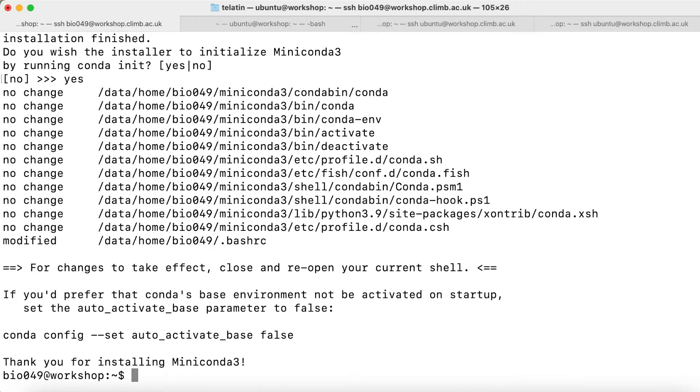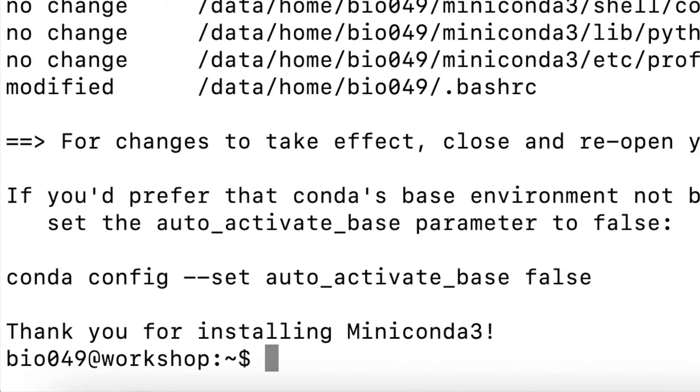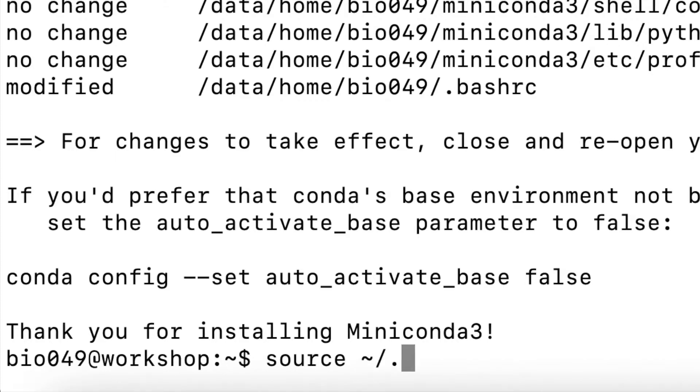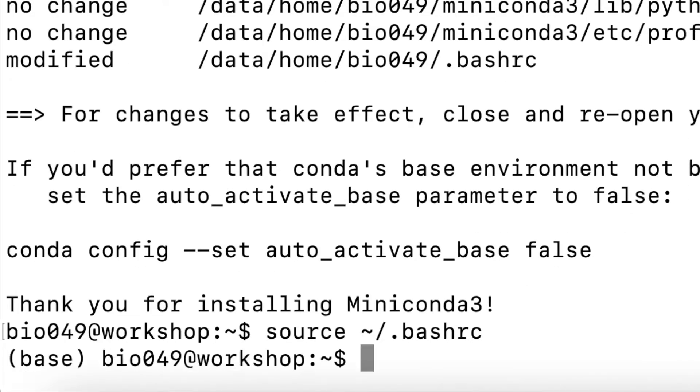Now Conda is installed but not yet active. In order for the change to take effect, we can either log out and log in again, or source tilde slash, that is in our home, there is a file called bash-rc, and we can source it. If you see, now we have base, that is the current Conda environment, highlighted in our prompt.